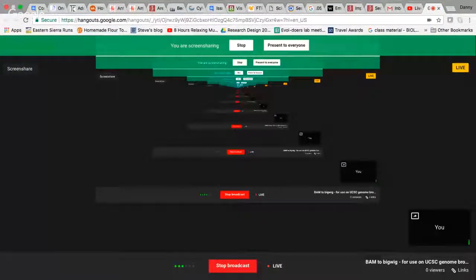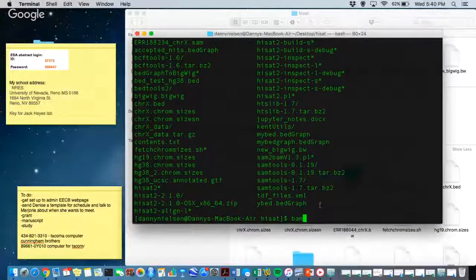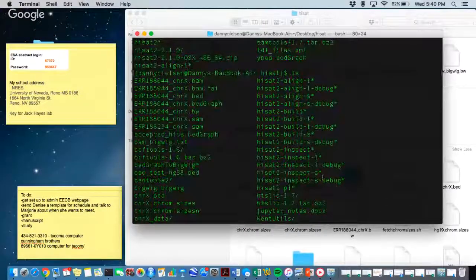Okay, so first I'm just going to show you my folder here. This is the directory that I've been doing all this work in. Some of the previous videos that I've made were to create this BAM file right here.